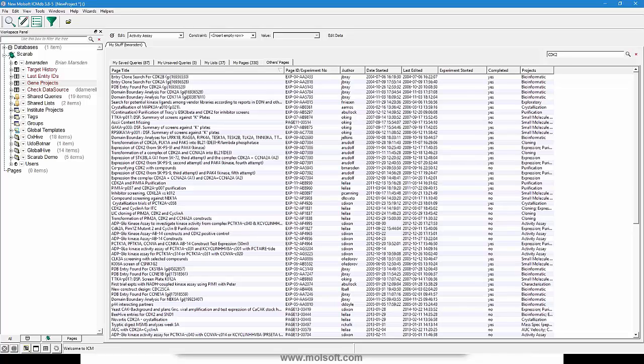Anything else, Andy? We had a question about different formats of data that you can import. One was, I guess, they're asking about structure PDB and other chemical formats. Yes. So the pages are really quite naive. They don't really understand things like SDF files or PDB files. Instead, you would tend to put in things like SDFs, for example, into the structured part, and I'll show you that in a minute.